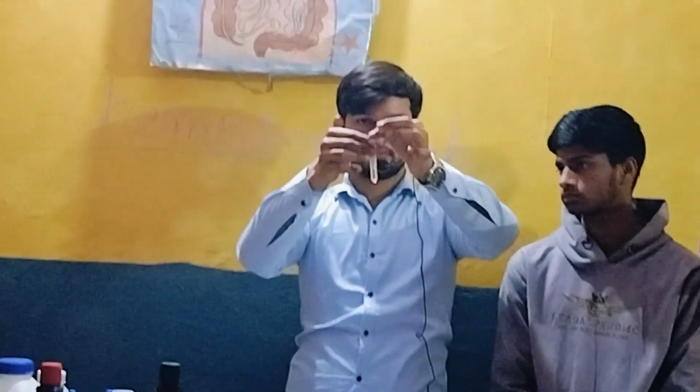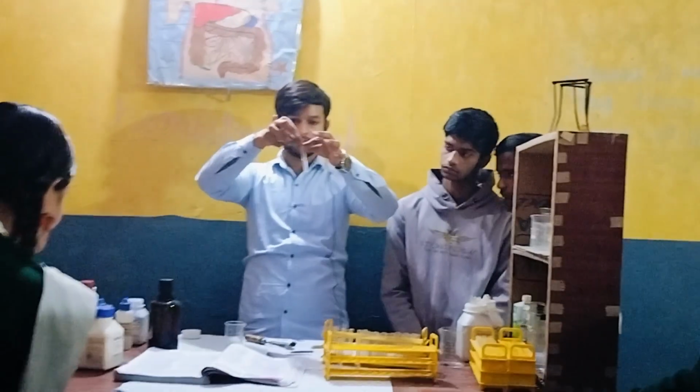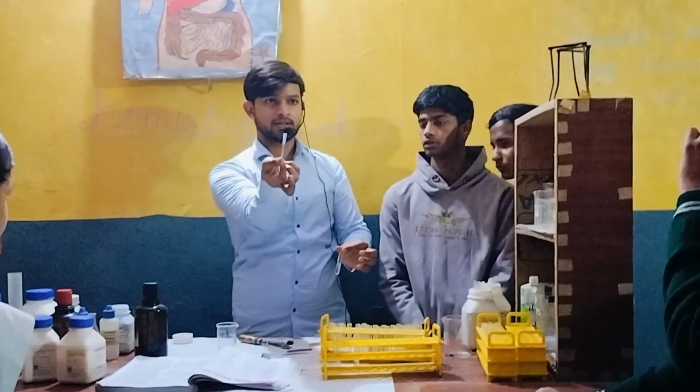Please see. Okay. Nothing will happen. Okay? Just blue litmus paper into base, then it will remain blue. See. Blue color. It is blue in color.